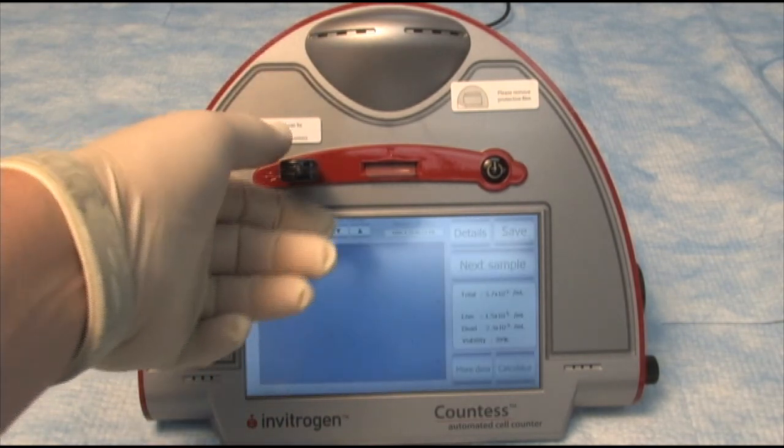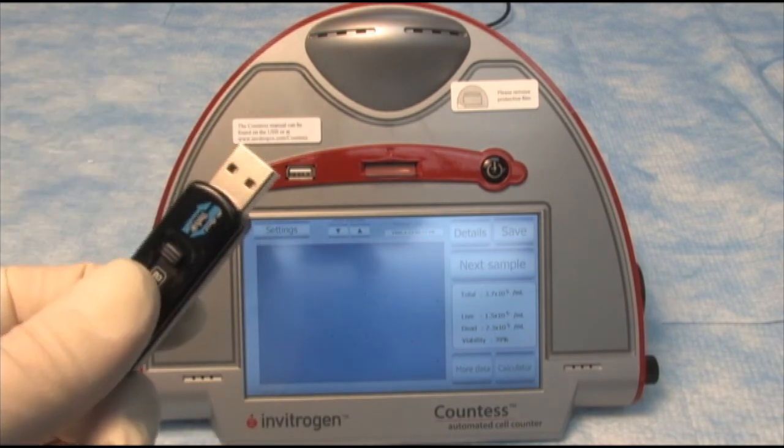And now, back to my desk, review my results.